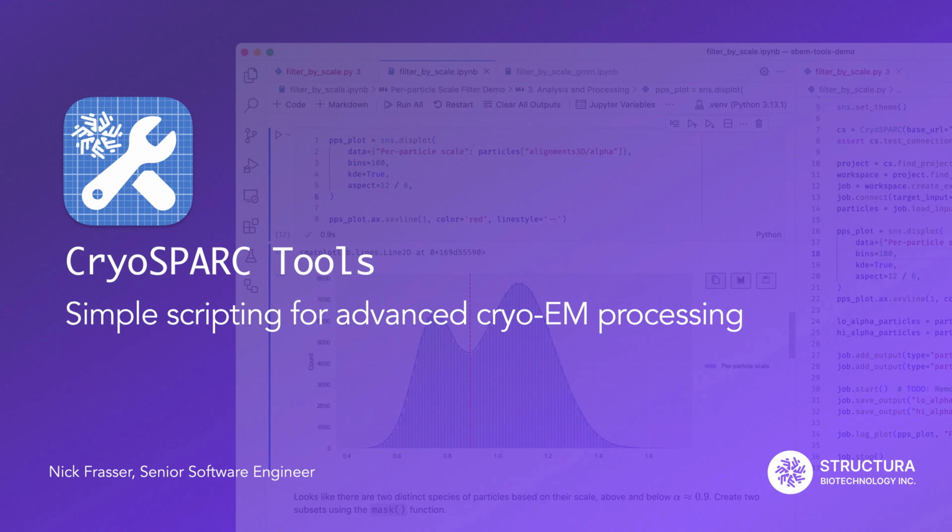Today I'm going to talk to you about CryoSPARC Tools. This is a software package that we've developed to facilitate advanced cryo-EM processing in CryoSPARC via Python scripting. I will show you how you can use CryoSPARC Tools in your own advanced workflows.